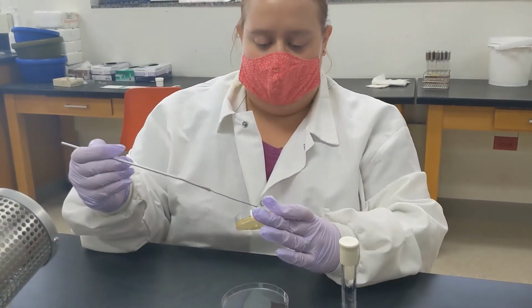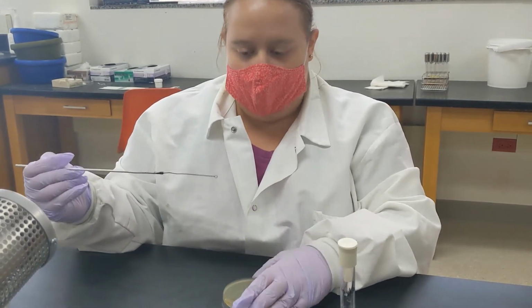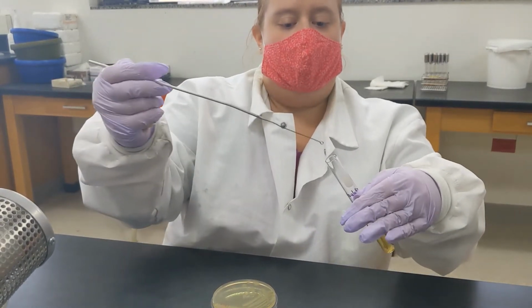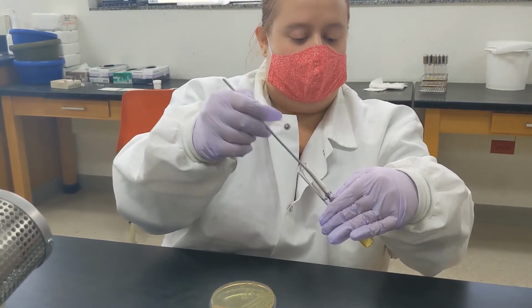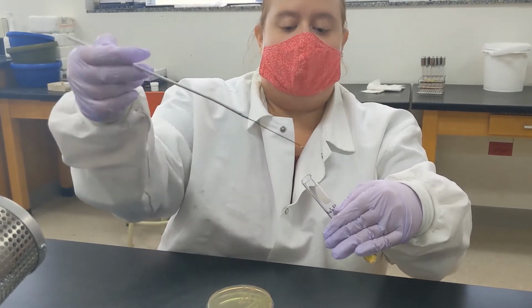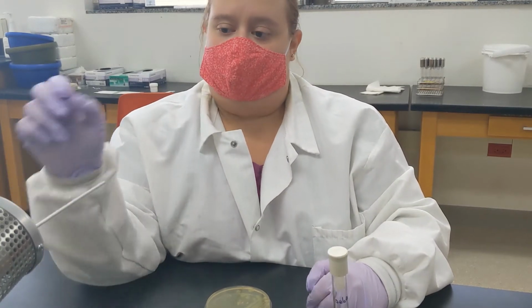And basically, if your organism produces these proteases that break down gelatin, your gelatin tube is going to stay a liquid when we solidify it, or when we put this on ice. So that's your positive result. If your gelatin tube turns solid after putting it on ice, your organism is negative for these proteases.